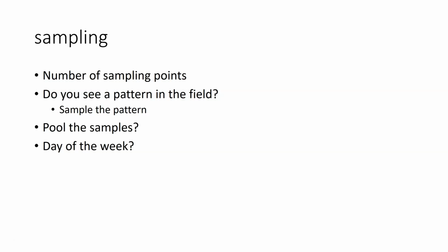You want to have it basically dried down. If you're getting a tissue sample, never send it in on a Friday or Saturday or the day before a holiday, because you have to make sure that that sample is going to be received by the lab during a regular workday so that they can take that sample and possibly freeze it or put it in the refrigerator or start the drying process on it.